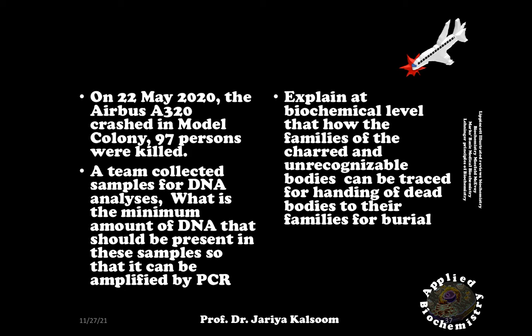The sorted double-stranded DNA fragments are then subjected to a blotting technique in which they are split into single strands and transferred to a nylon sheet. These fragments are subjected to autoradiography, in which they are exposed to DNA probes, and these probes are radioactive. A piece of X-ray film is exposed to the fragments. A dark mark is produced on the X-ray where radioactive probes are attached.